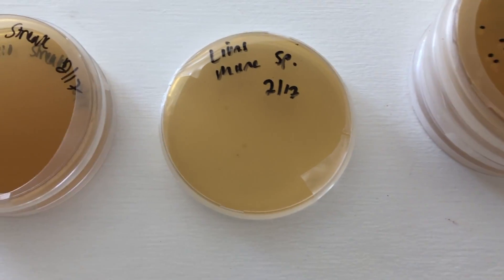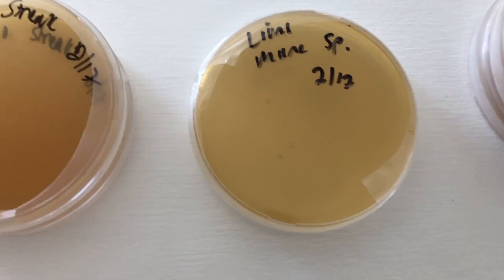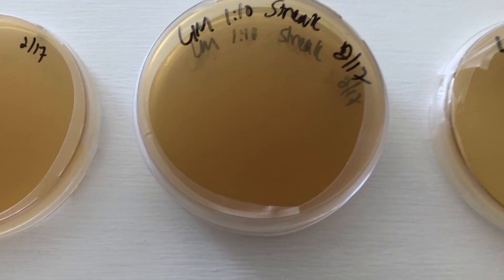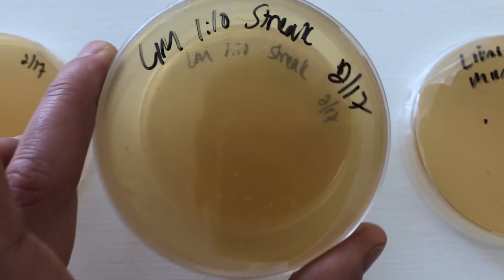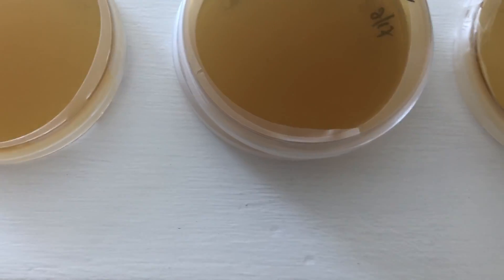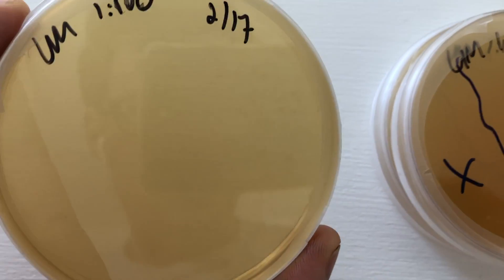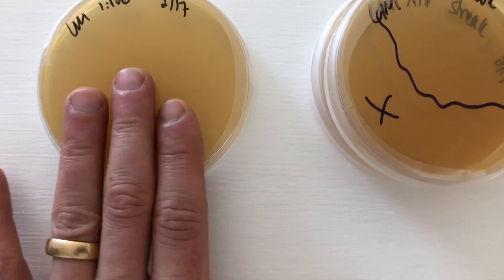Moving on to the lion's mane — I did a direct streak right here, and it looks like we're getting some bacteria, so I'm gonna go ahead and mark those. The streak plate is starting to show some bacteria as well, so I'm just gonna mark this off. But I've got a clean 1-to-100 dilution for the lion's mane, so still staying hopeful.